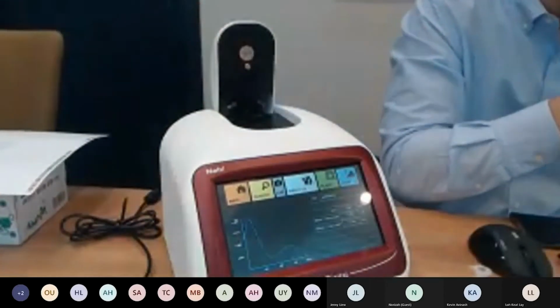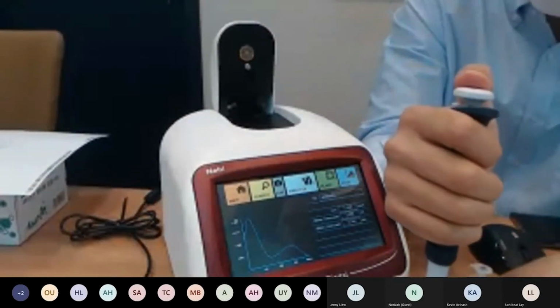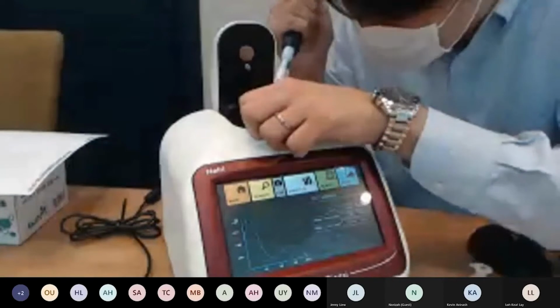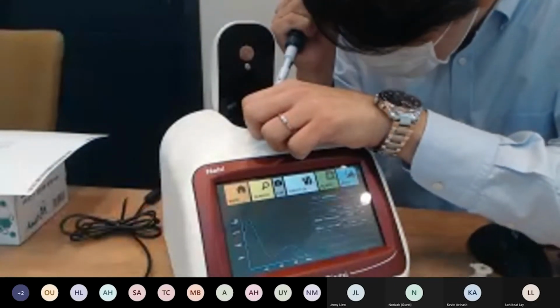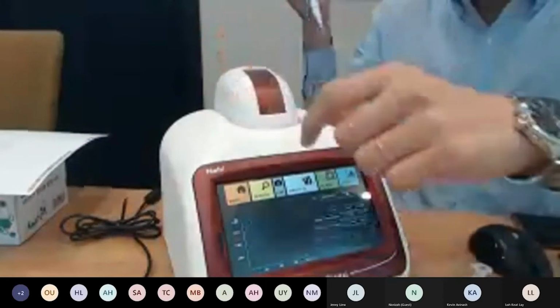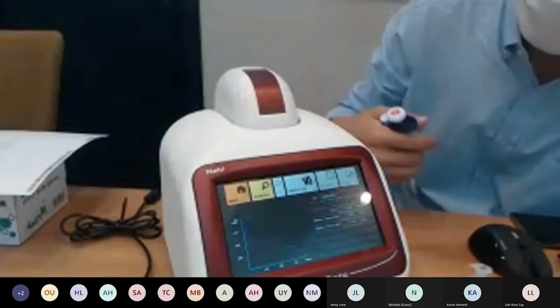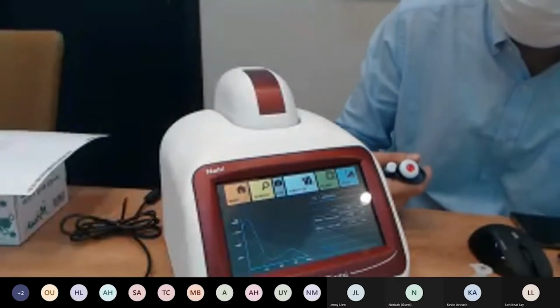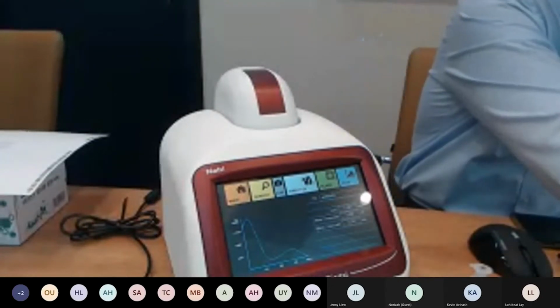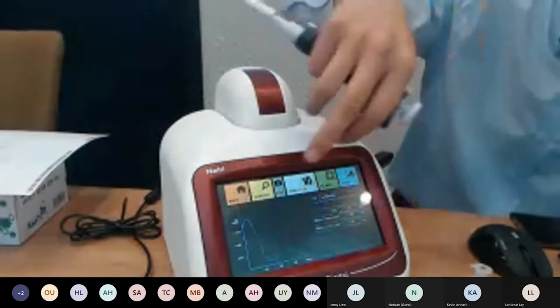As I mentioned, for protein samples, you need to take your time and be very careful, otherwise it will form bubbles when you're pipetting it. And 3.297. So again, CV very good with the graph looking exactly the same shape.